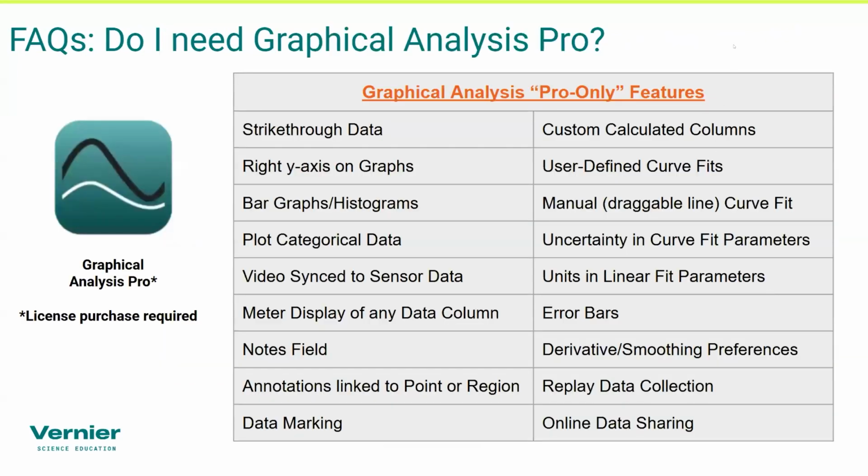The big question that's coming up is, well, do I really need Graphical Analysis Pro? And that's a fair question. What's in that? Certainly there's very robust data collection and analysis functionality in the free version of Graphical Analysis, so you certainly want to start there in general.